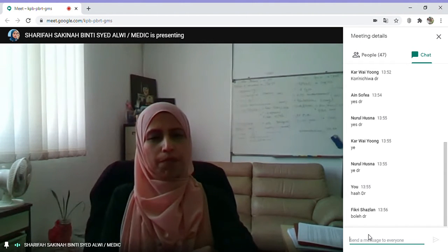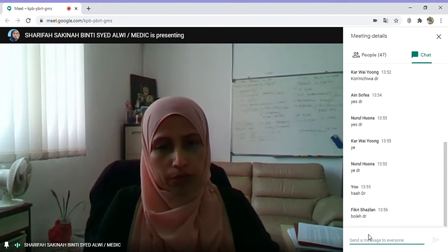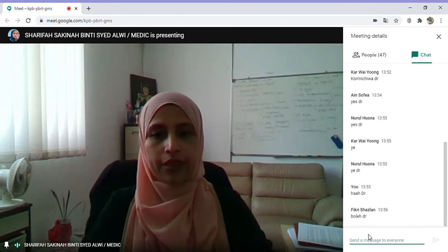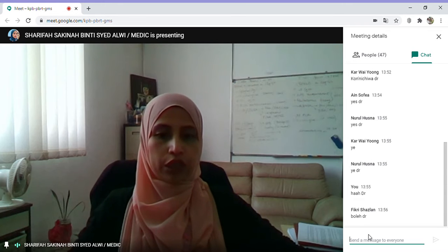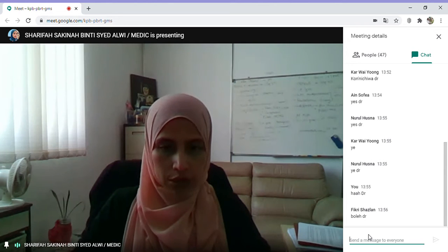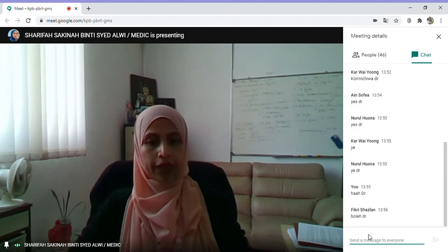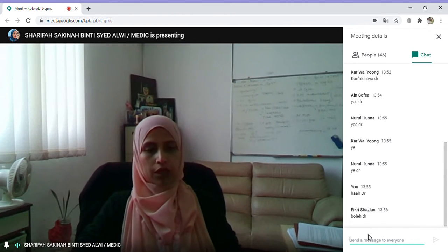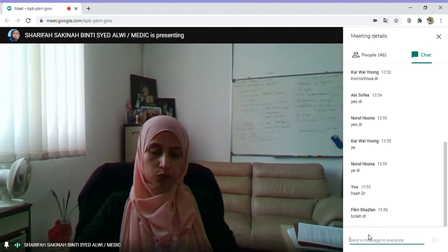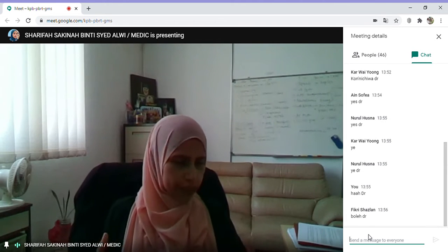Introducing the particle or cell into the flow cell. Flow cytometry is performed on particles in suspension, such as cells or nuclei. The inner column of the flow cell consists of liquid sample. The outer column of sheath fluid controls the diameter of the sample column so that it narrows and isolates single particles. The single particle passes through a laser beam. The light scatter is detected by a photodetector. This will be a bit difficult because you don't see the machine itself.